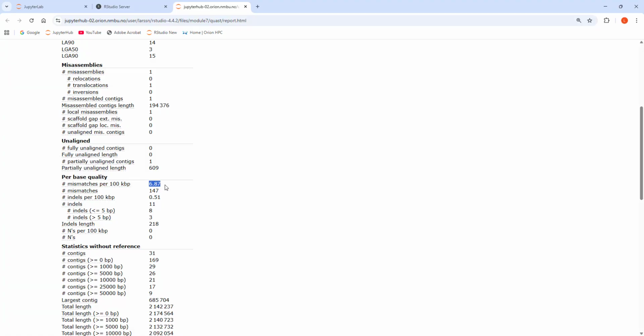For instance, we will later in this module also assemble this genome based on nanopore reads, long read technology. And then we get better assembly in terms of longer and fewer contigs. I'm sure you will see that.